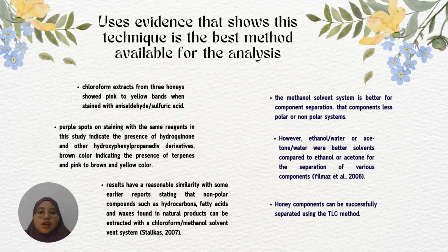From the journal, the methanol solvent system is better for component separation than less polar or non-polar systems. However, ethanol-water or acetone-water were better solvents compared to ethanol or acetone for the separation of various components. And the journals prove the honey components can be successfully separated using the thin layer chromatography method.